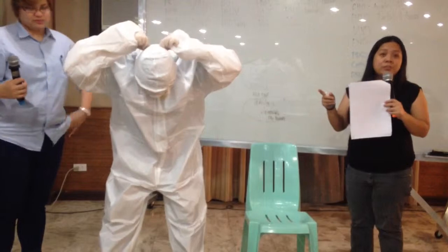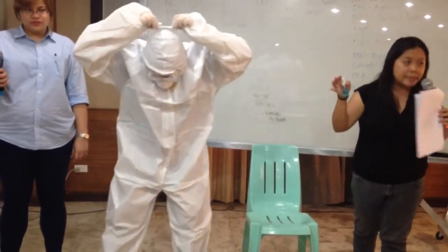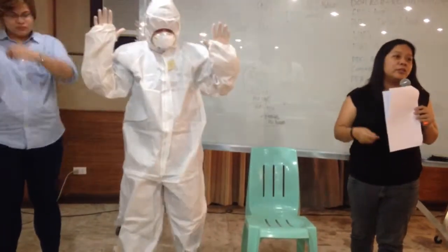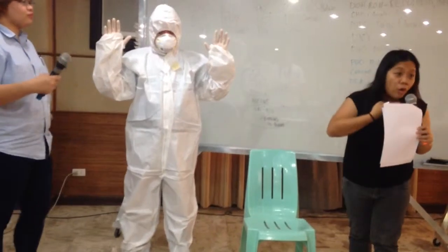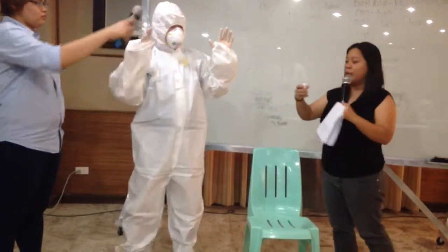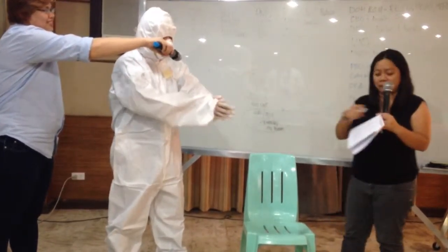When removing the face shield, lean forward so that it goes straight down into the yellow disposal bag — so that it does not touch our face. After that, disinfect the inner gloves again. We keep on disinfecting. Disinfecting inner glove.